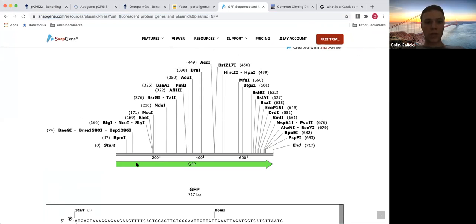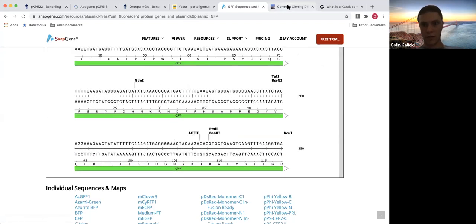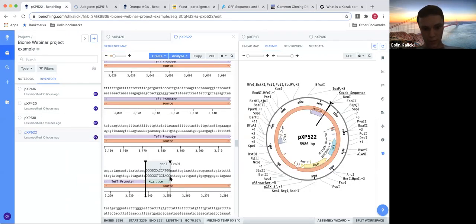And a nice thing it does too is it lets me look for certain restriction enzymes. Now let's say SacI was here. I don't believe it is here. I thought I checked. I don't see it on one pass through. Cool. You don't want it to be there because maybe some restriction enzymes stay over, and well, you just killed your gene. So this will show you the whole sequence. This is hard to copy and paste. However, you can find this also too. This is going to have the entire sequence that we want. So we just copy and paste it. A lot of what this is, is copy and pasting.